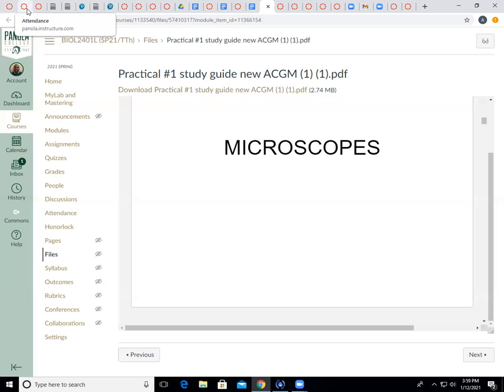Very good, very good. All right. Romero, section 9. Okay, so it tells you the chemical states that it's in, molecular weight, pH, whether it's acidic or basic. Very good.